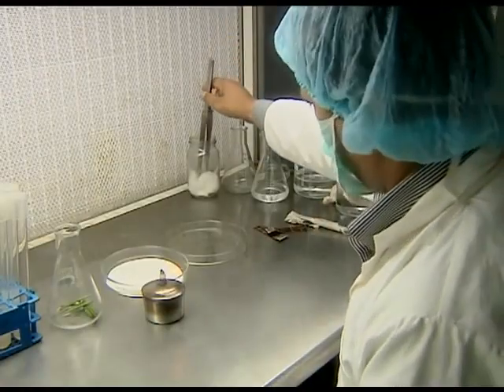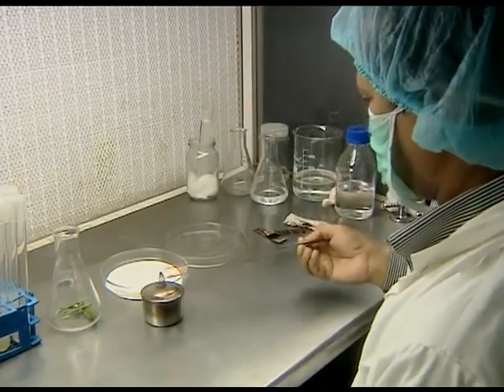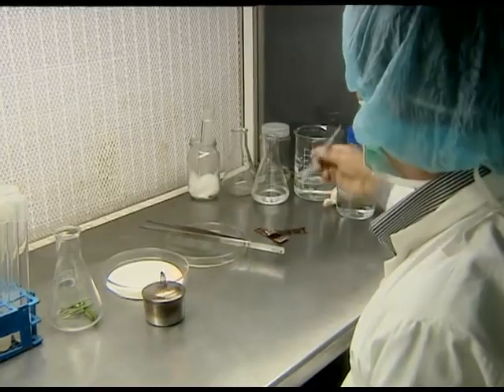All the apparatus are dipped in 70% ethanol, flamed using the lighted spirit lamp and allowed to cool.